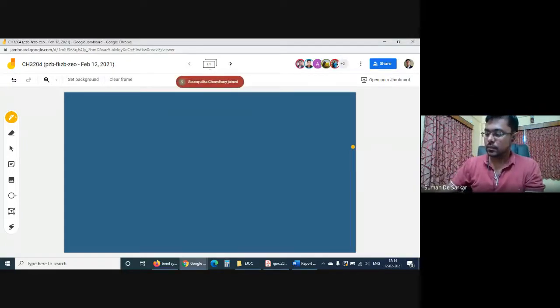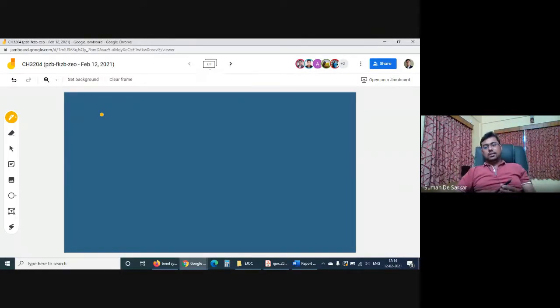As Professor Halder already mentioned, this reaction is a bit unique in terms of a couple of features compared to the previous experiment. First of all, no solvent is used here, so it's a dry grinding reaction. So only the starting material and a pinch of water just to make a pasty thing. So this is one point.